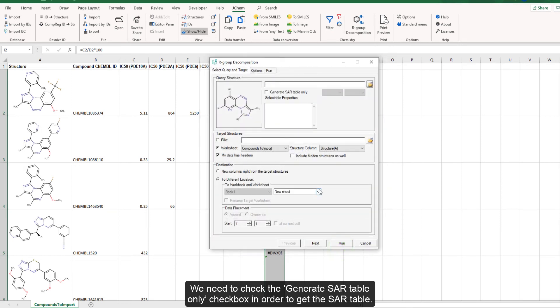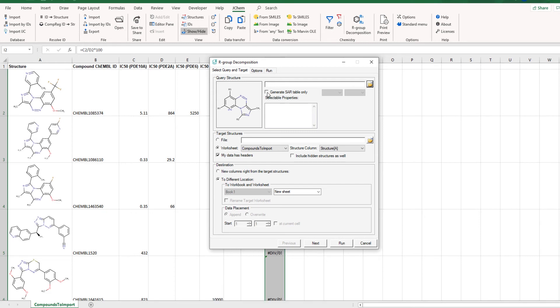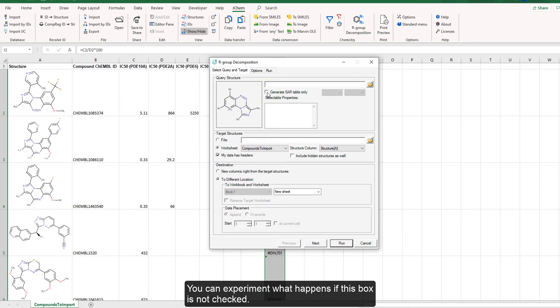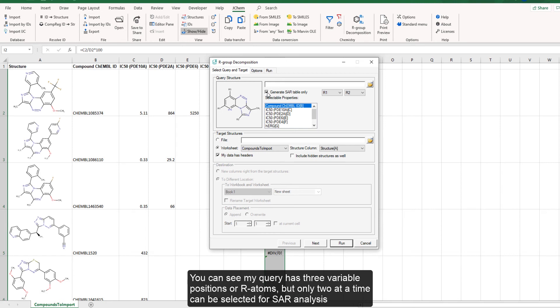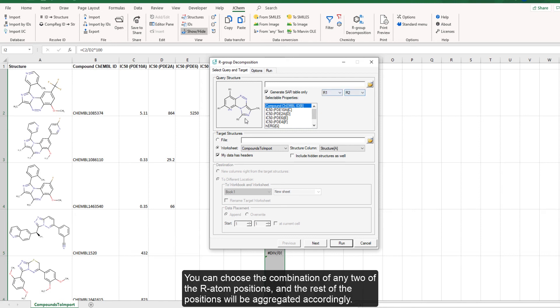We need to check the generate SAR table only checkbox in order to get the SAR table. If this box is not checked, you will get a decomposition report rather than an SAR matrix. My query has three variable positions or R atoms, but only two at a time can be selected for SAR analysis. You can choose the combination of any two R atom positions, and the rest of the positions will be aggregated accordingly.